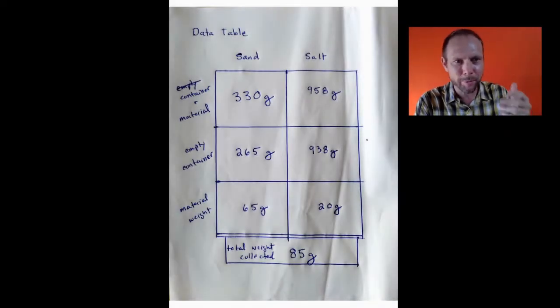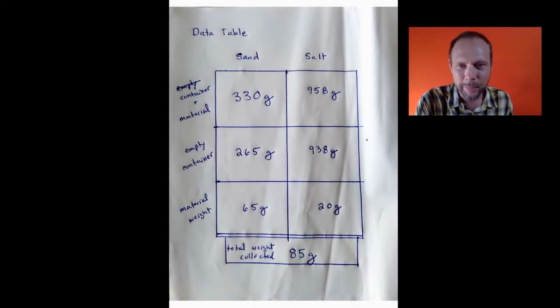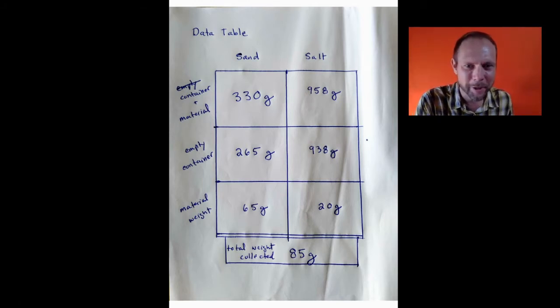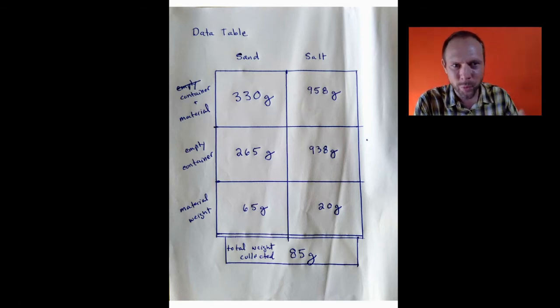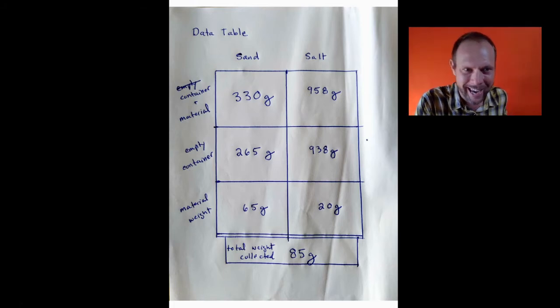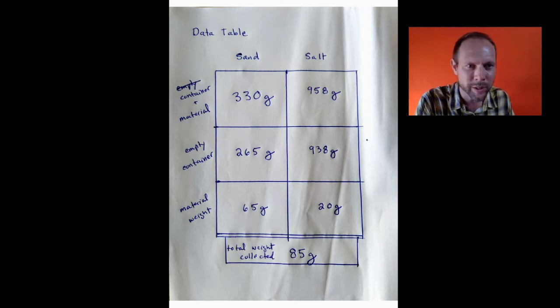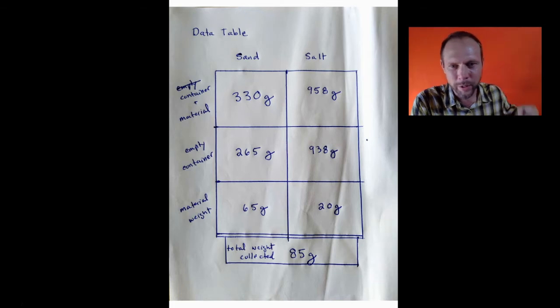Okay, so we have our data recorded. The experiment is finished. It's obviously not a perfect result, and yet that's the way experiments go. The result is never quite perfect. The idea now is that you might think a little bit about what really happened, what wasn't exactly perfect about this experiment, and maybe even how you could do it better if you'd come up with a new procedure, even a new data table, if there was anything maybe that was missed in the experiment that you would have included.